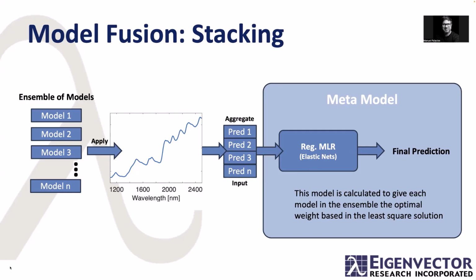I think in the final release, with the PLS Toolbox, we are also going to have the option of doing the regression with PLS. But you can imagine that that's a very low ranking system. So you are going to be arguing, should I include 1 or 2 latent variables? If maybe your data is non-linear, maybe you have a third degree of freedom. That's the kind of stuff that I like about MLR, because even though you have to optimize for L1 and L2, you can do a grid search, and that optimization is going to be automatic.